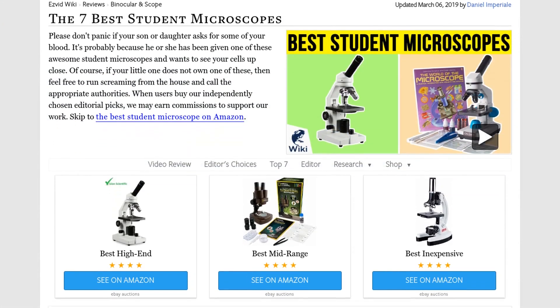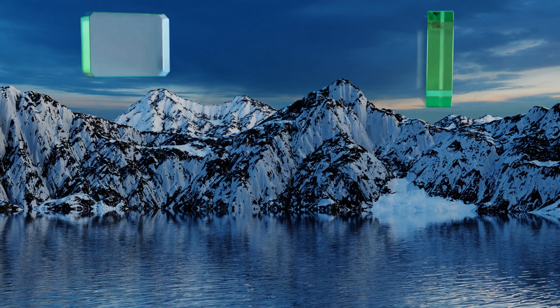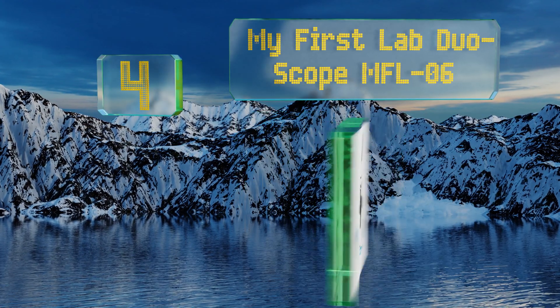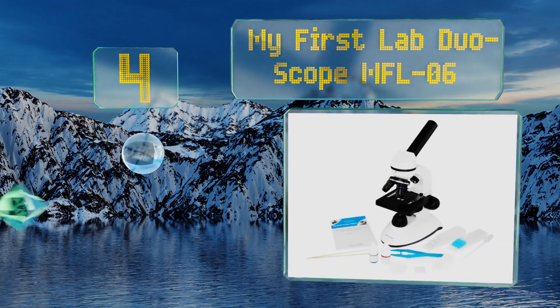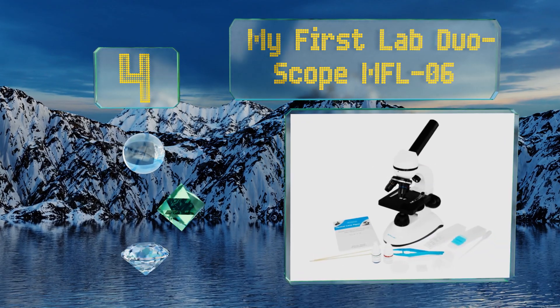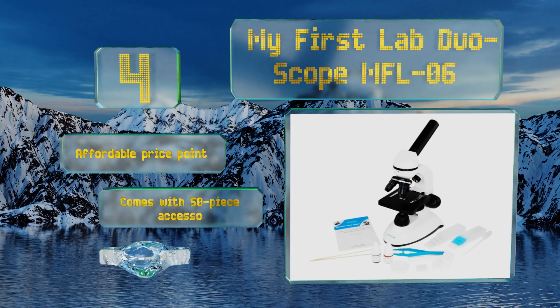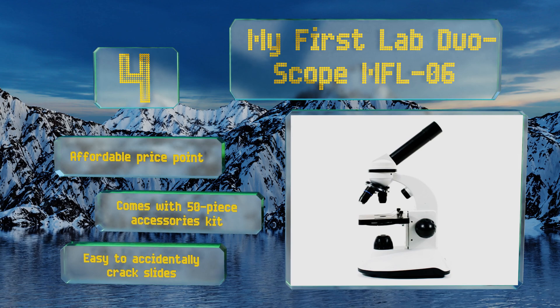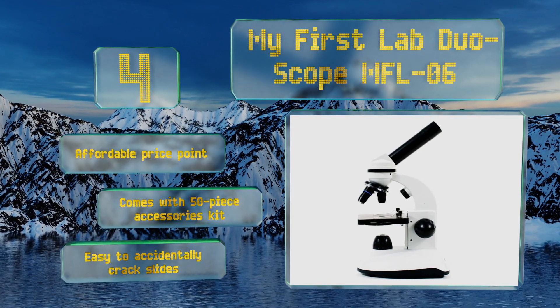At number four, the My First Lab Duo Scope MFL-06 bridges the gap between a toy and a genuine scientific instrument. It only offers a top magnification of 400 times, but it operates just like a professional grade model, making it a great teaching tool. It comes in at an affordable price with a 50 piece accessories kit, however it is easy to accidentally crack the slides.